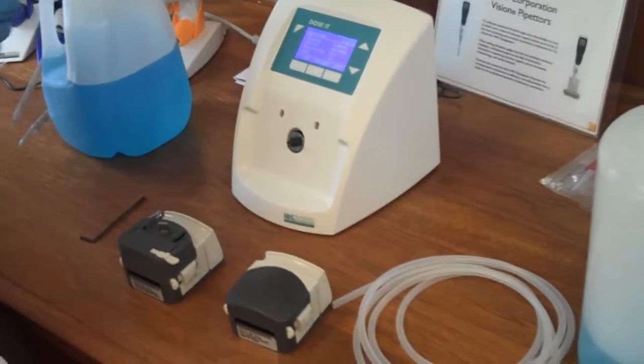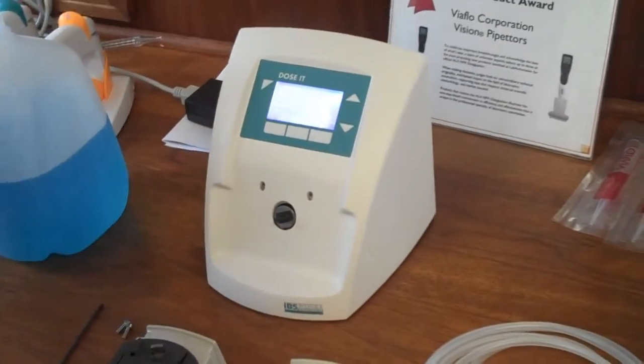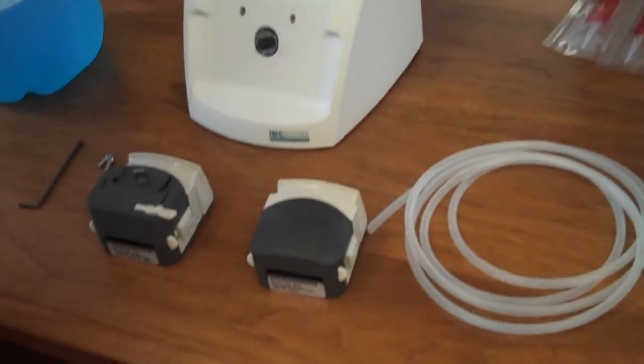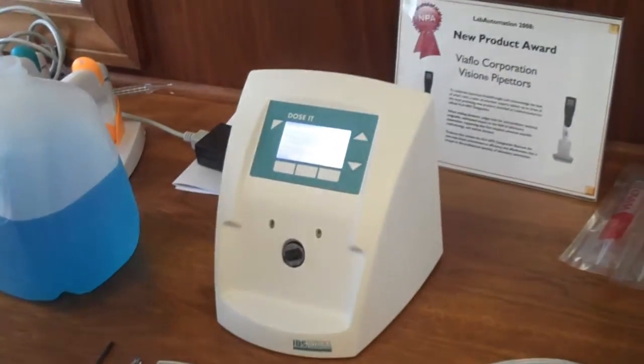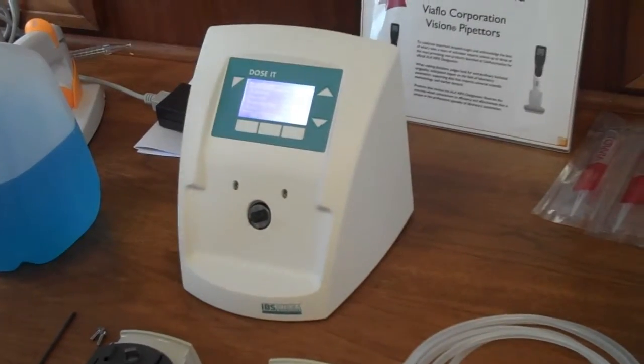We're here at the IBS DOSIT, which is a simple to use, easily programmed peristaltic pump, and we're going to show how it can function as either a single pump head device or a dual pump head device for larger volume dispensing applications.